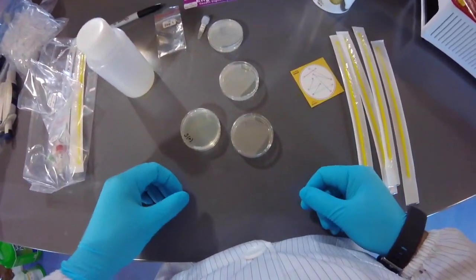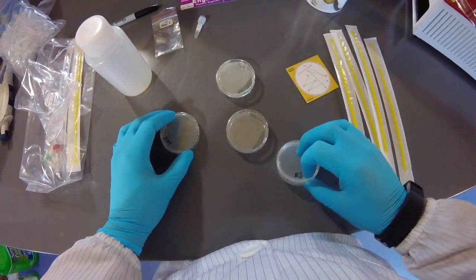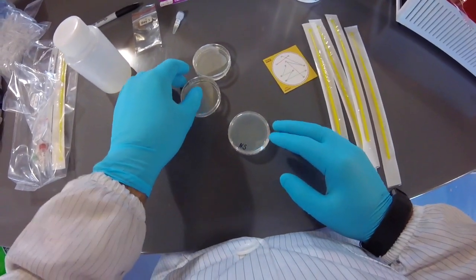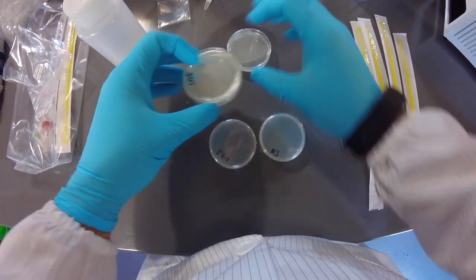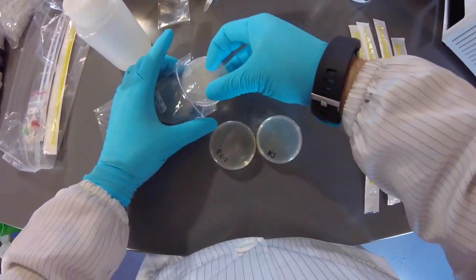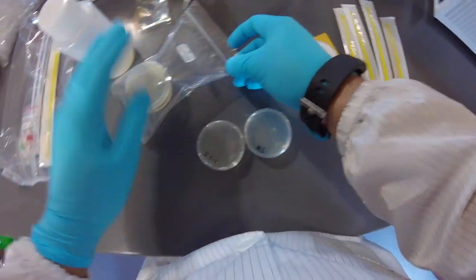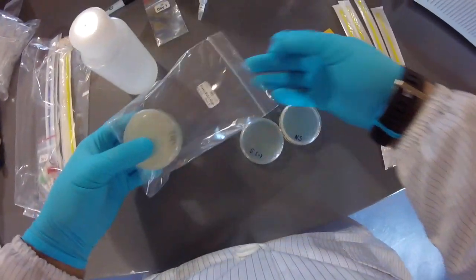All right. So for today, on day one, we're going to need the non-selective plate to streak blank cells. And we're also going to do the negative control plate. These other two Petri dishes can go back into your Petri dish bag, and they can go into a fridge. These are sterile, or they should be pretty sterile, so there's no bacteria on them yet, so generally they can go back into a fridge.